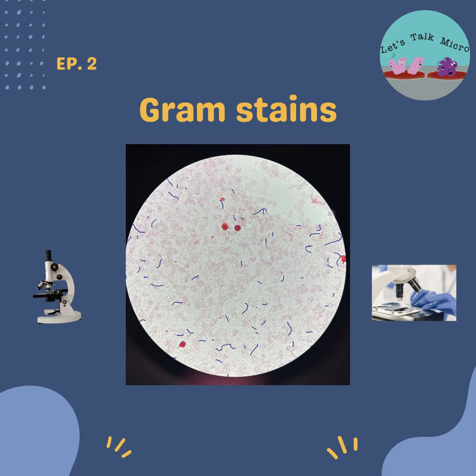They write you up. You potentially altered the treatment of your patient when all it took was a few minutes to do a slide and find out. So the gram stain is a very important technique. As far as being that important, it provides a mechanism for the presumptive ID of pathogens. And we'll talk more about this on the next episode.